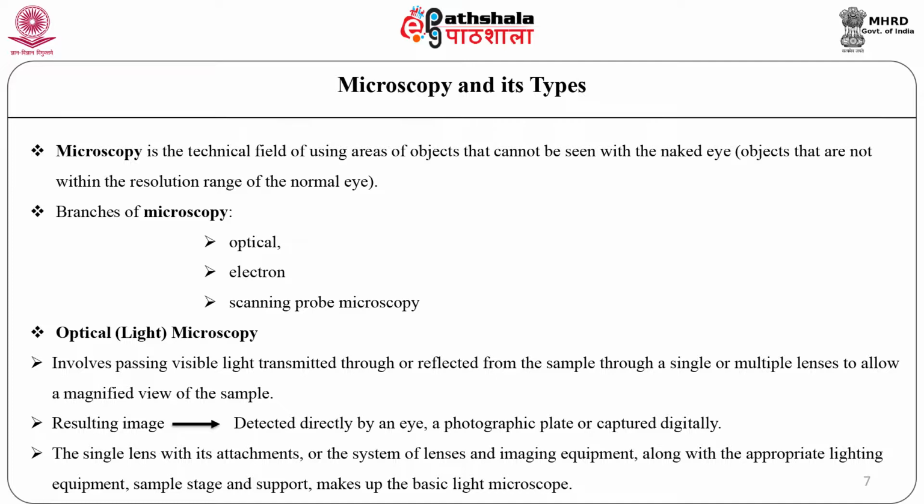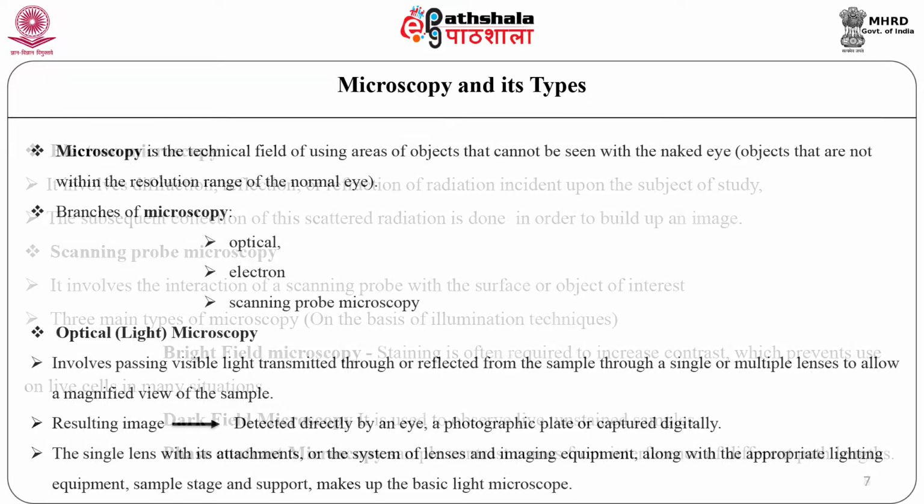Optical or light microscopy involves passing visible light transmitted through or reflected from the sample through a single or multiple lenses to allow a magnified view of the sample. The resulting image can be detected directly by eyes, imaged on photographic plates, or can be captured digitally.